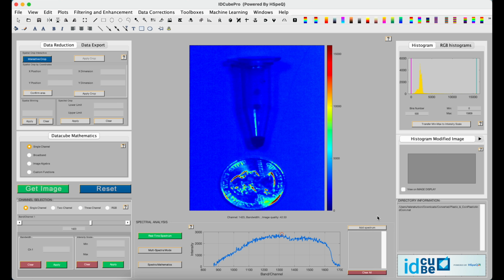This feature builds a 2D or 3D scatter map for the entire data cube. It enables a user to separate clusters via the k-means method and visualize their position on an image. It enables a user to visualize up to 10 clusters and can calculate the area covered by each cluster in pixels. It's important to note that this toolbox supports parallel computing to accelerate computation. Large files might take a long time to compute. A typical time for a 50 megabyte file takes about 10 minutes on average.